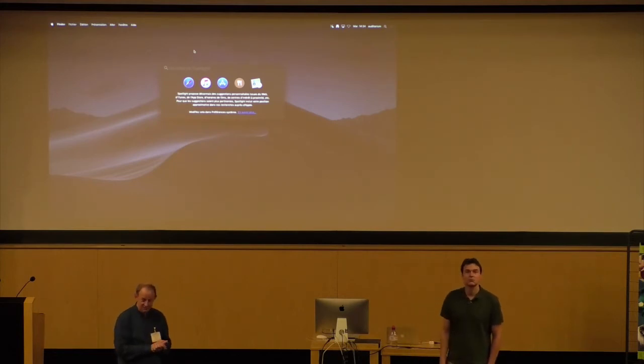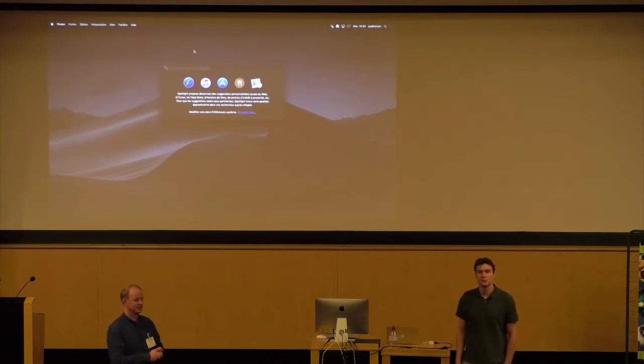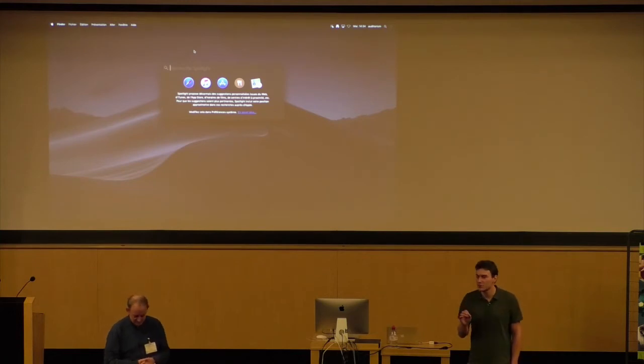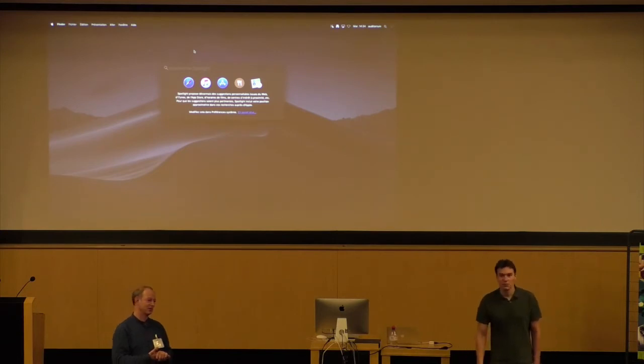Did you try to do some tomography to see where the particles are sitting in the film? I'm planning to do this, I haven't done it, but it's planned, yeah. And can you control the ice thickness somehow, by waiting more time? Yeah, by waiting more time for sure, but this also drives the concentration a lot. So what you try to do is really have it as short as possible, to have the air-water interface for a really short time and not a lot of evaporation. But I think the thing is really how you spread it, how you do the glow discharging, how you withdraw the sample. And then by choosing the right offset temperature for having this little bit of evaporation to get to the right thickness.